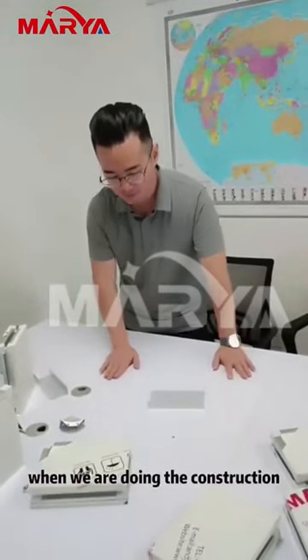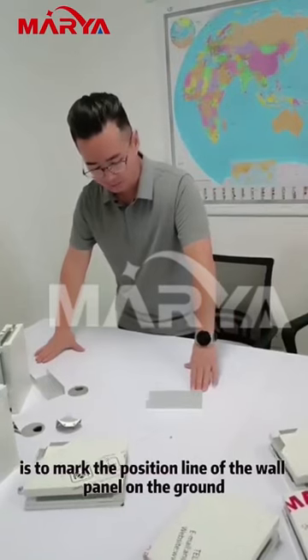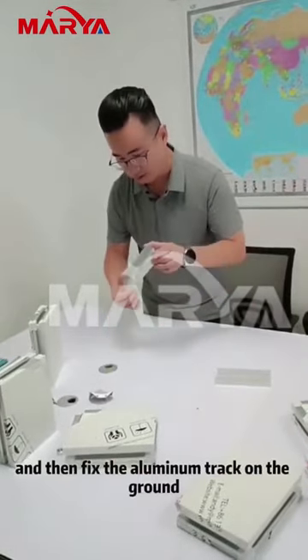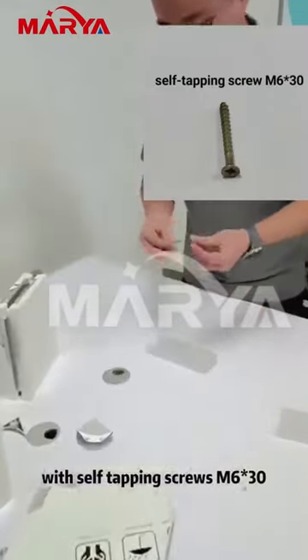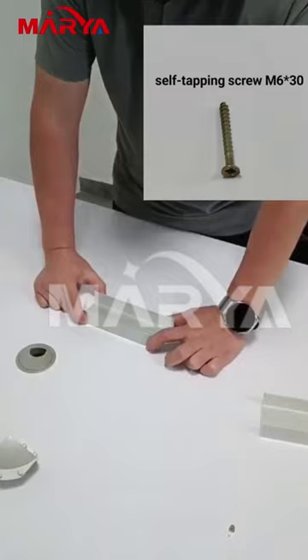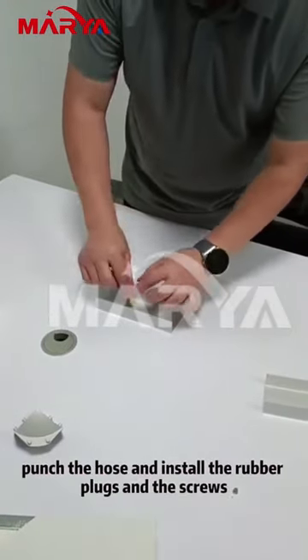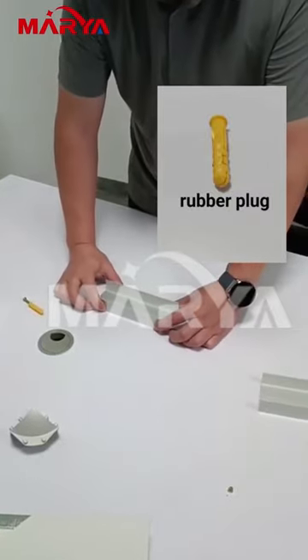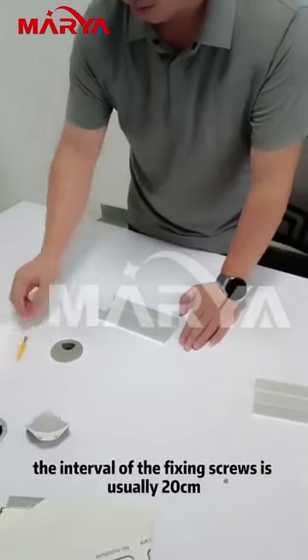When we are doing the construction, the first thing to do is to mark the position line of the wall panel on the ground. Then fix the aluminum track on the ground with self-tapping screws M630. Align the aluminum track with the position line, punch the hole and install the rubber plugs and the screws. The interval of the fixing screws is usually 20 centimeters.